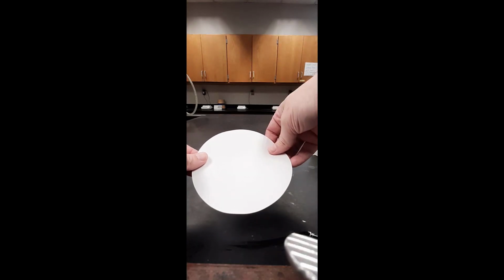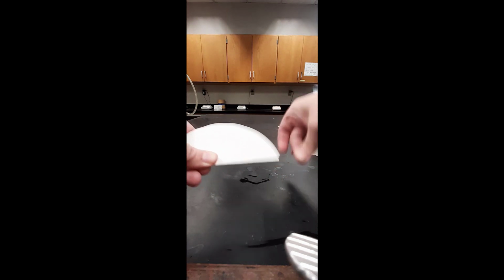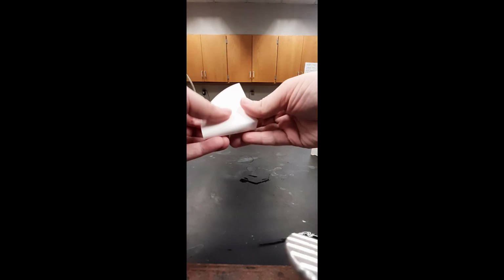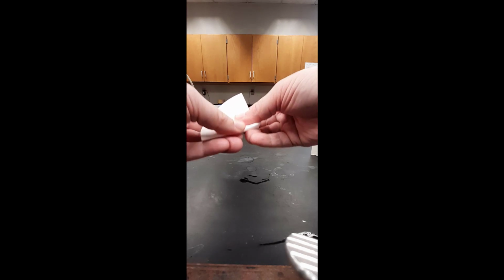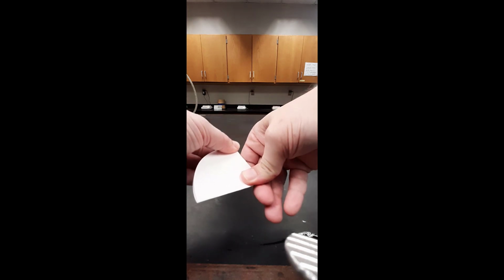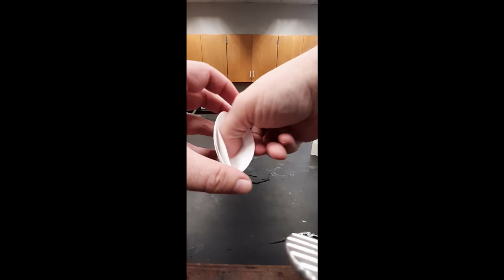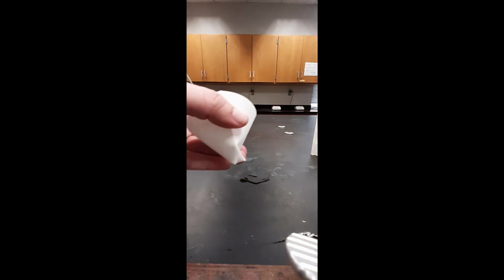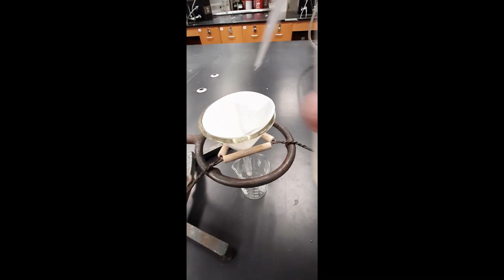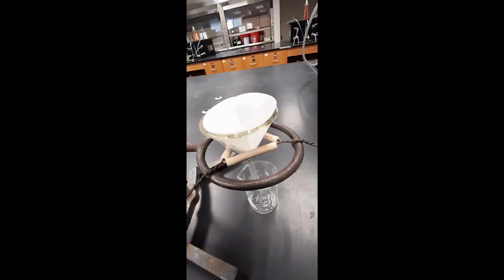I take a piece of filter paper and fold it initially in half, and then I fold that in half again to produce quarters. I then open up the filter paper, separating it so 3/4 is on one side and 1/4 is on the remaining side. And then I put that filter paper in a glass funnel and wet it down with deionized water so that it sticks better to the glass.